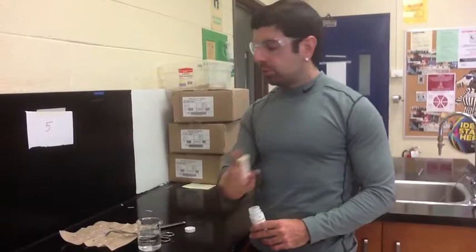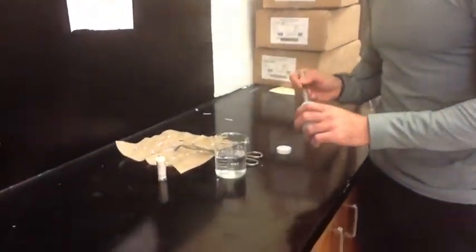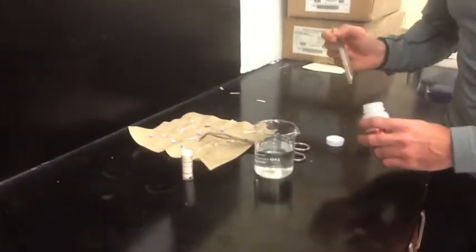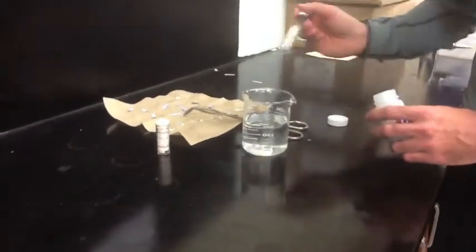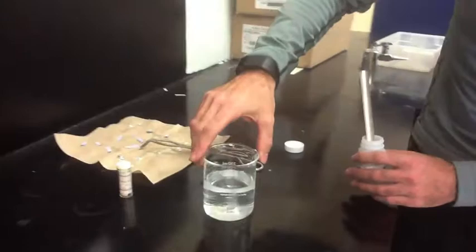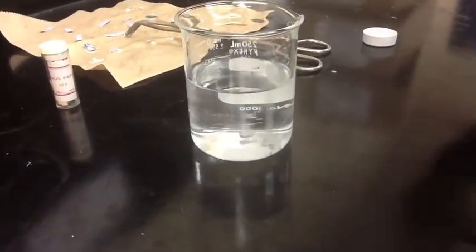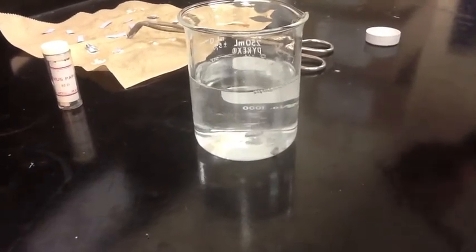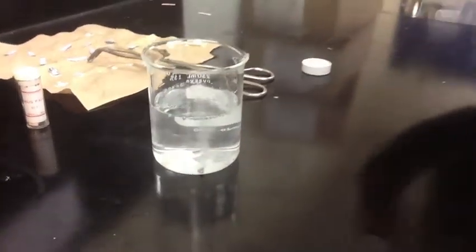So we're going to take a piece of calcium and drop it into this beaker of water. I'm going to put another one there to see the show. If you look really closely, you're going to see it's effervescing. It's giving off bubbles. Please don't give me the answer that it's giving off bubbles, because in chemistry, bubbles refer to gases.